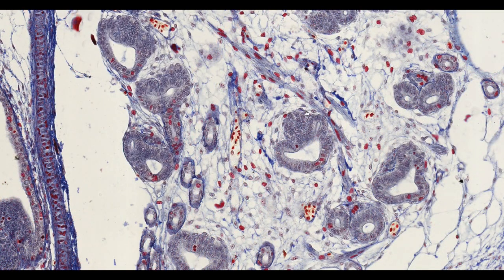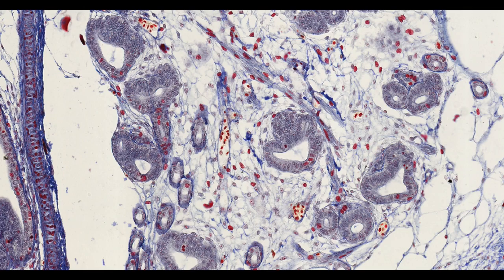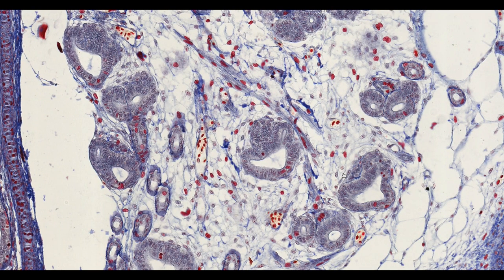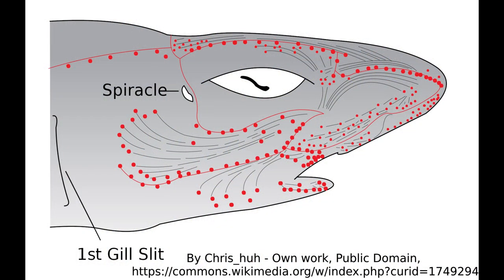We can even see some nerve fibers such as these cells here making their way through the connective tissue and connecting to the bulbs of the ampullae to take sensory information to the central nervous system. The bulbs and ducts of the ampullae of Lorenzini are filled with a thick gel-like substance.